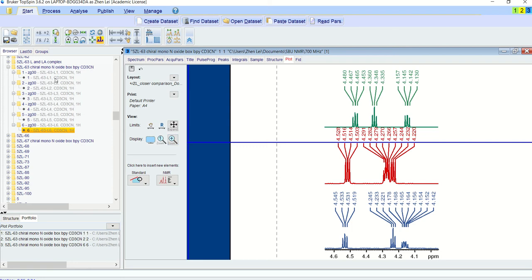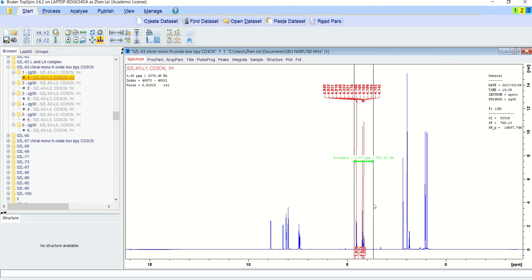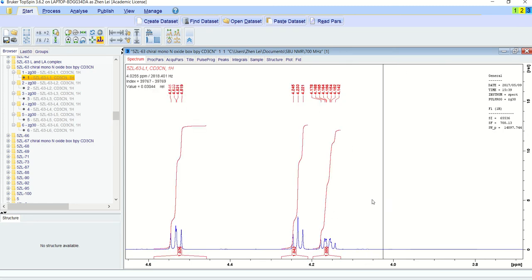So for example, in here, I want to show you three data, and I have one comparing the 3 spectrum within 4.1 ppm to 4.6 ppm each. So first you need to make sure the chemical shift is showing exactly the number you want to show. You just type in the dot and type in ZX and put down the chemical shift you want to compare in here. Or simply you can just select the range you want to copy and show in this range.